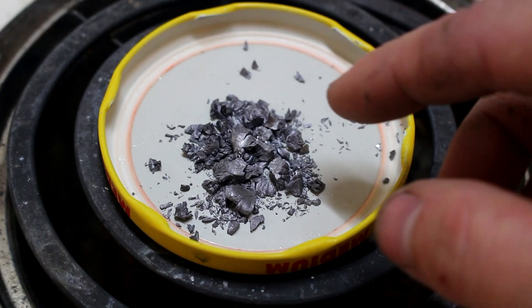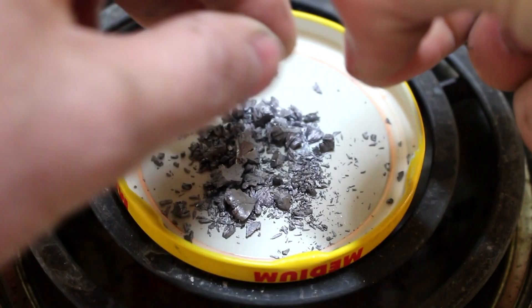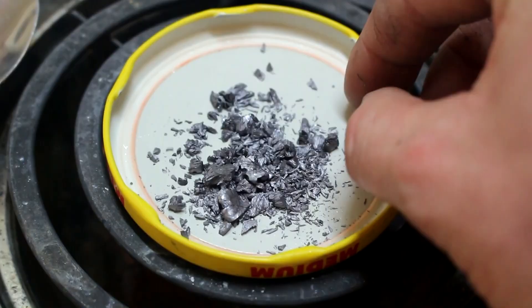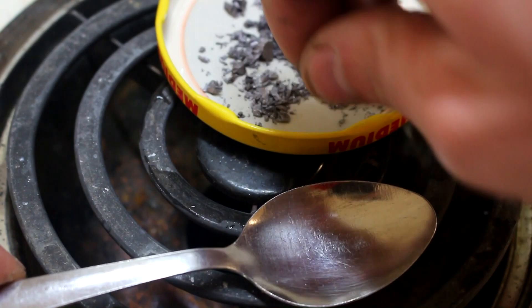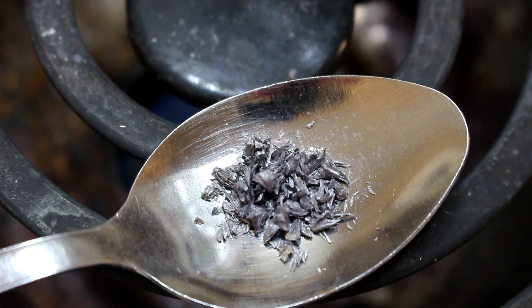Here it is, fully converted into gray tin. It's expanded quite significantly. It's incredibly brittle — I think I can actually break this apart and crush it into powder with my fingers. And that's not even hot enough to melt tin yet.